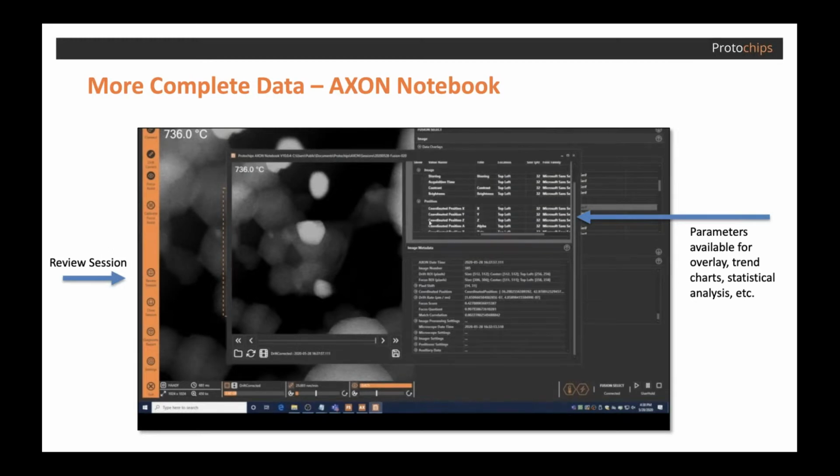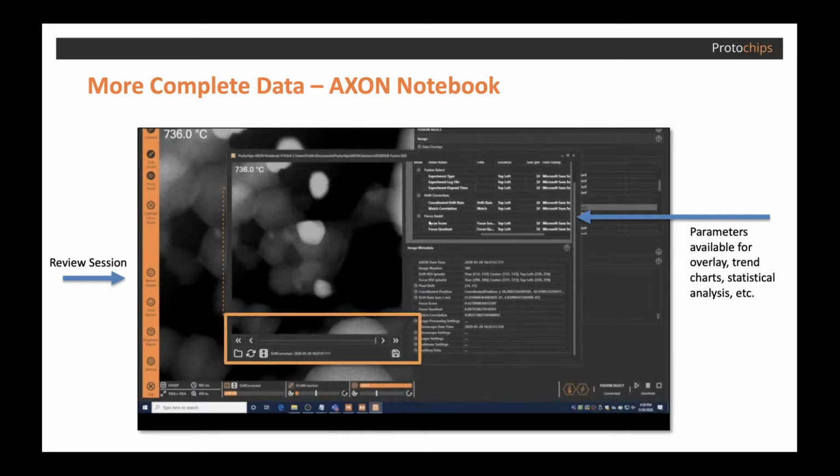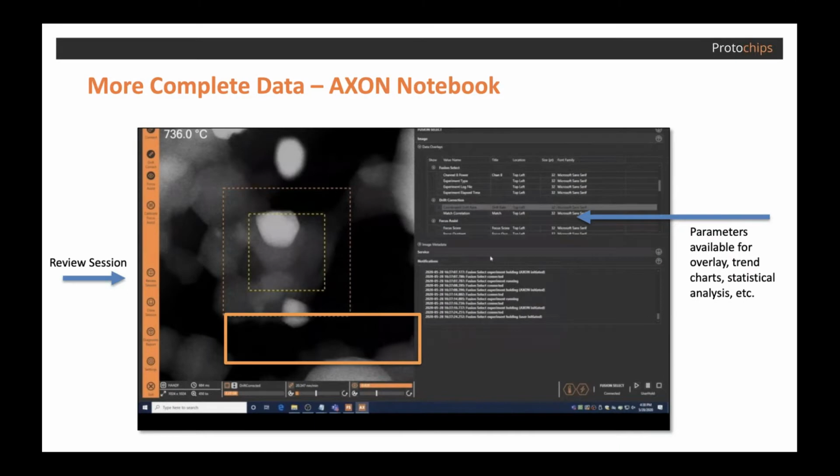Once the overlays were chosen, we could use that scrub bar again to scroll through the data and see the overlay change with the image. The drift corrected and overlaid data can then be exported as lossless PNGs, ready for insertion into a talk or a publication. We aren't publishing this data from our experiment, but I think most, if not all of you, have experienced just how tedious it is to process and overlay information onto your images.